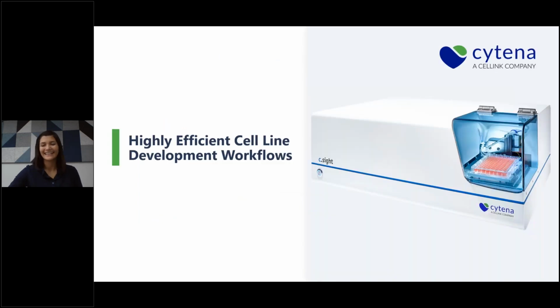So, hi, I'm Anna. I'm happy to take over. So thank you, Adrian, for the short introduction to GoToWebinar. So now I want to present you highly efficient cell line development workflows. And today's focus will be on the C.SIGHT, so the device you can see on the right side.